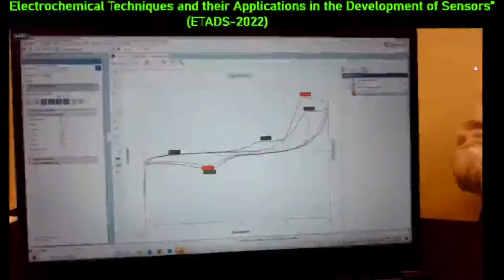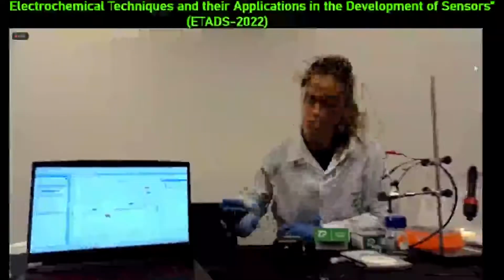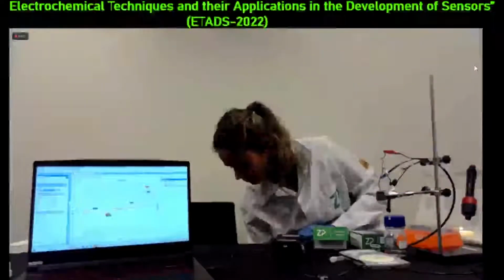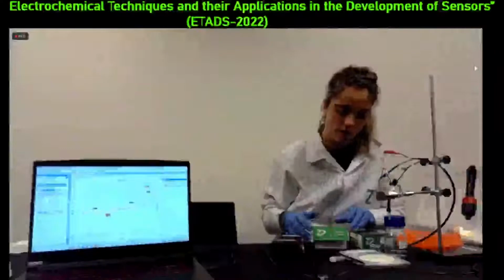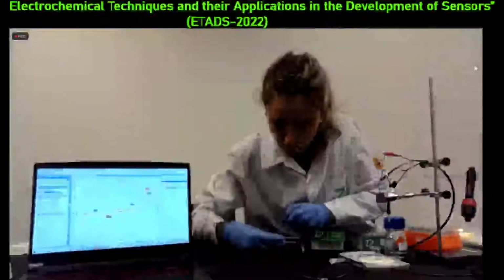To follow up on this, we will now try a weaker chili solution. So we will change the solution for a weaker one. What I need to do is swap the sensor, because it's a one-time use sensor.